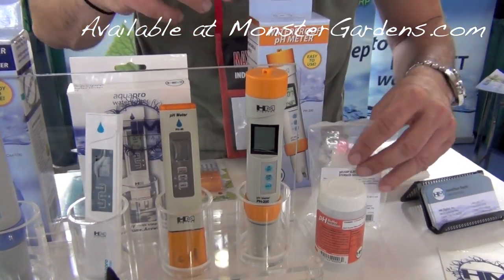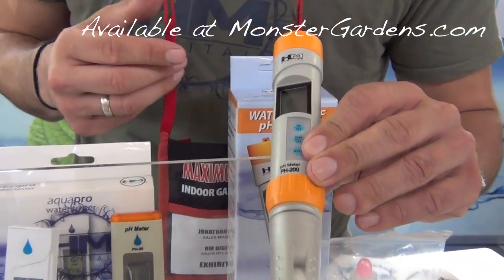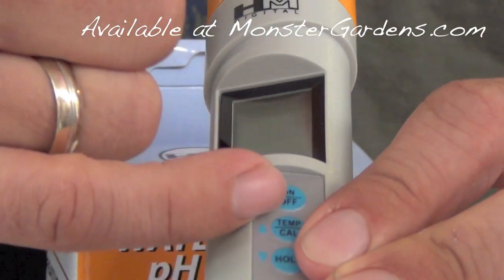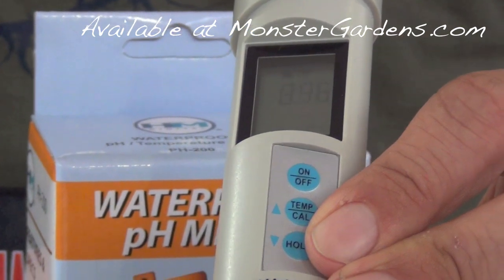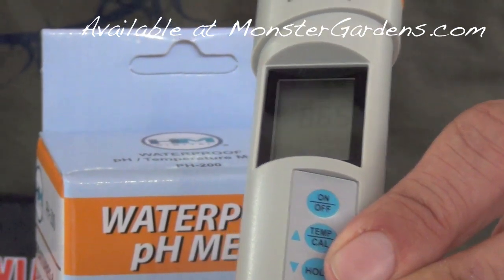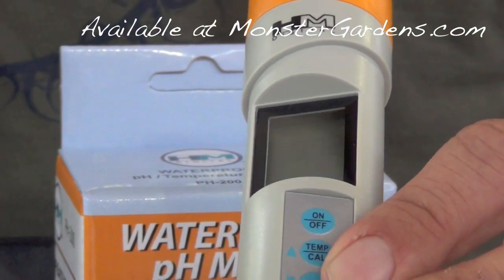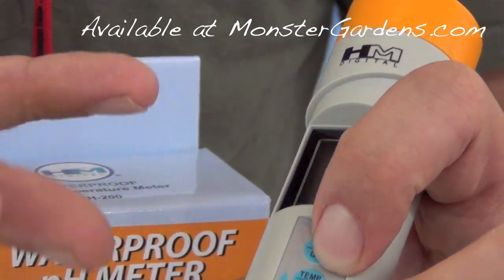We'll sell this separately. But to describe the features on this one: it has auto calibration. You can just hit the auto cal button and it's going to go to either 4, 7, or 10 — it's going to detect the solution that it's in. Or you can override that and just manually calibrate it. It's got .02 resolution.